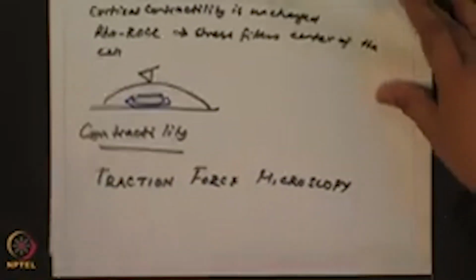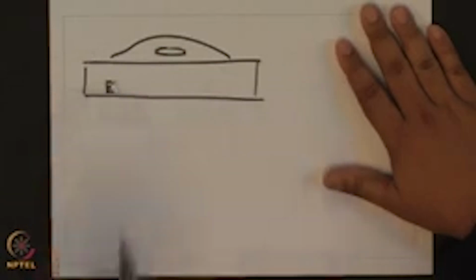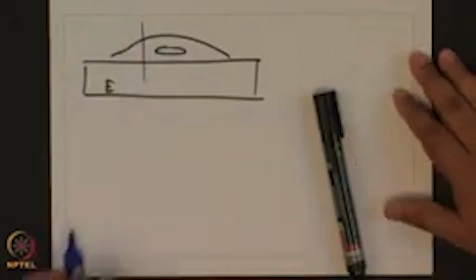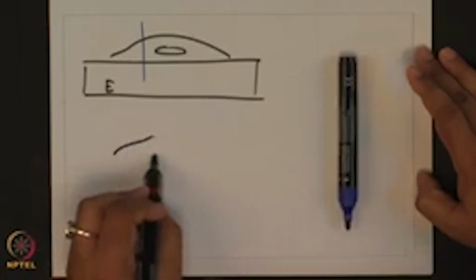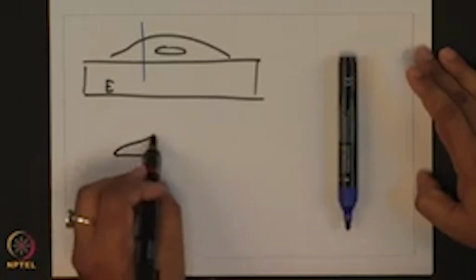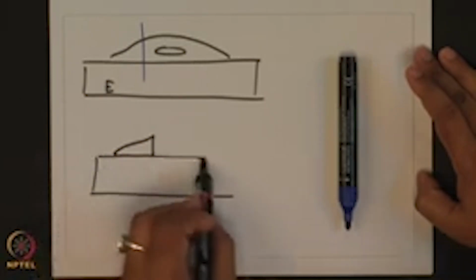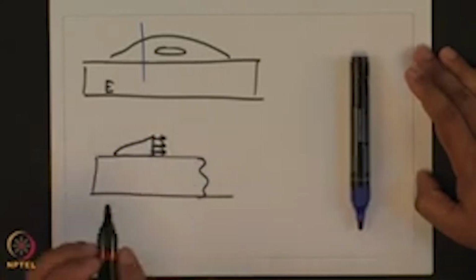Okay. So, let me explain what exactly is TFM. If you have a cell sitting on a substrate of given stiffness E, let us take a section of the cell here. What you have is a section of the cell, and the cell is exerting internal forces.